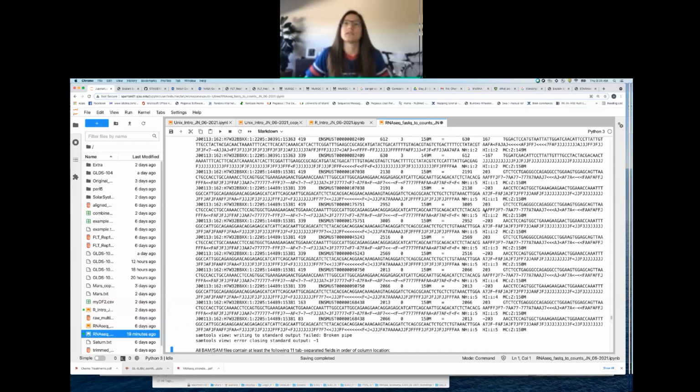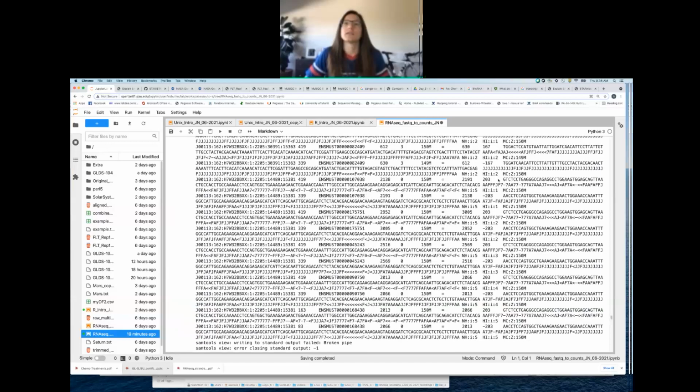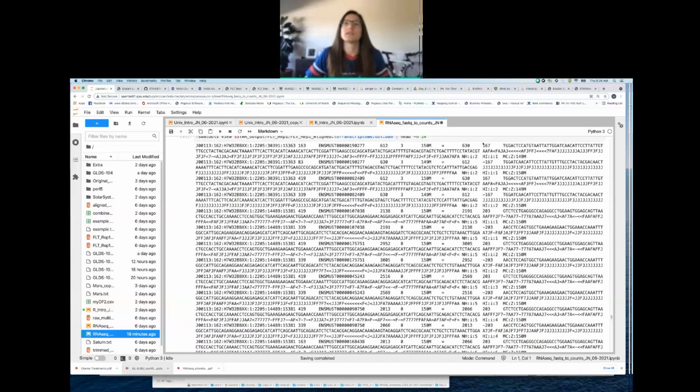And so we do. Now, one easy way, though this isn't always true because sometimes the insert size is going to be the same for different read pairs, is that you'll notice these first two transcripts indicated, first 4 reads, 2 mate pairs, we see that 167 insert size, again, in one direction. So I guess I should ask you guys, this first one as a reminder, this value here, which is the insert size, I already told you that. But the value here, what does that indicate?